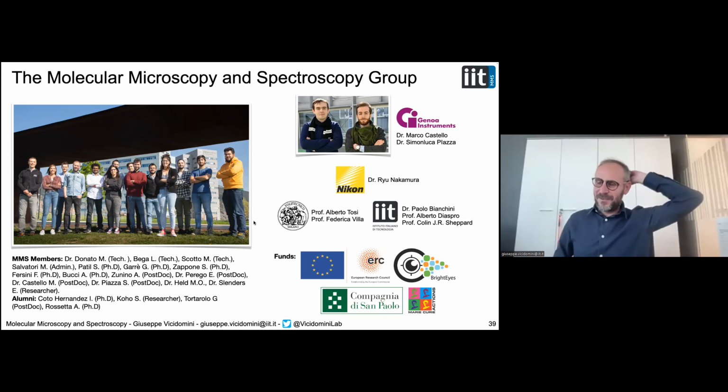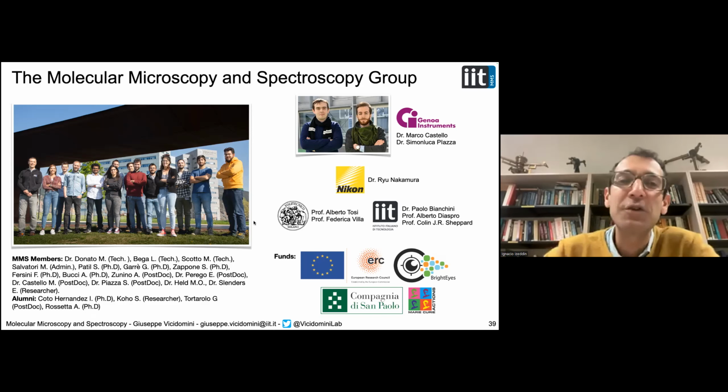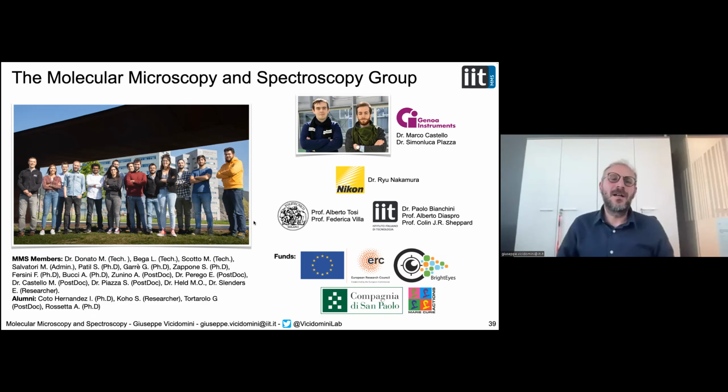Wow, a lot of really interesting questions, and they deserve a longer answer. The first one was about the axial resolution. Anyway, I can give you an introduction to a project that we are working on to use this detector array to improve also the axial resolution. These are a little bit more complex algorithms. It's not a pixel assignment, it's a maximum likelihood algorithm. But yes, we can improve the axial resolution because, as I told you, the detector, having an image of each probed region, also encodes information about the axial position of the structure. So we can decode this information to improve the optical sectioning.